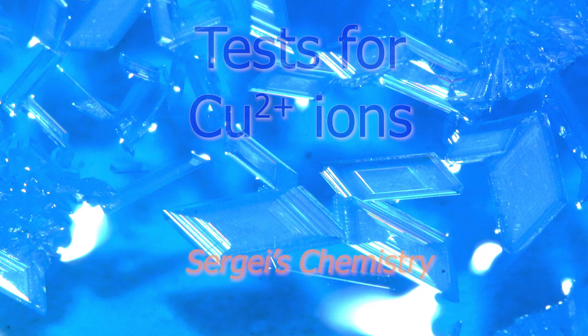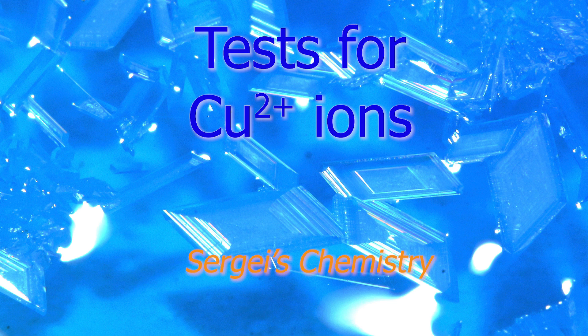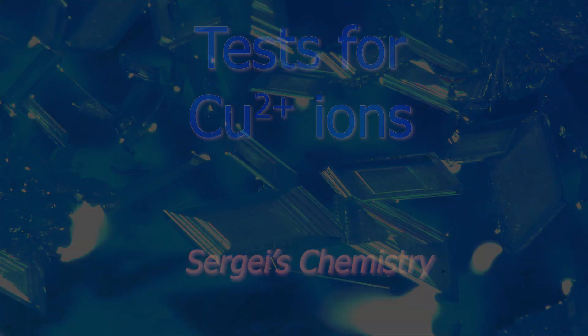Welcome to Sergei's chemistry. Today we are looking at tests for copper ions. Here on the background is copper sulfate crystals.